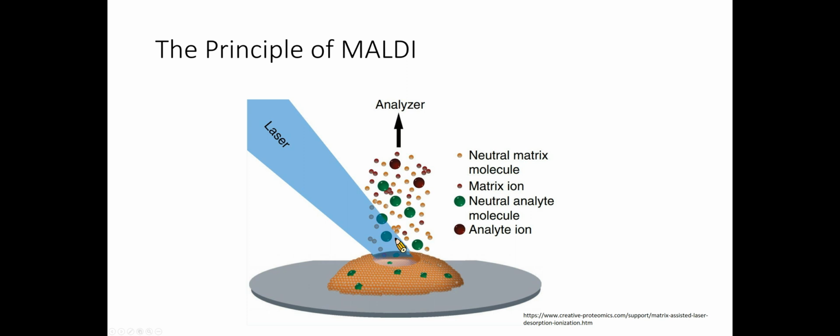MALDI is a mass spectrometry ionization method for directly vaporizing and ionizing non-volatile samples, but its ionization mechanism is still unclear. There are two possibilities: ions are formed in a solid state and the laser irradiation is only a simple release, or they are produced by a laser-induced ion-molecule reaction.